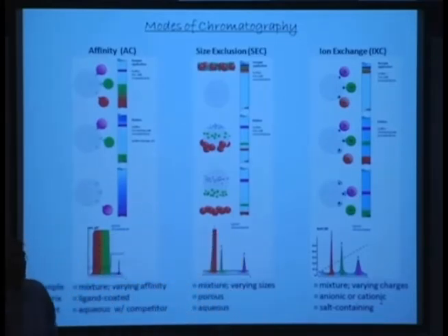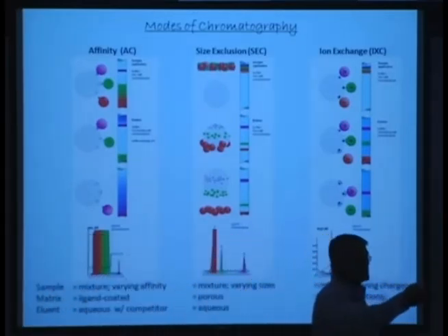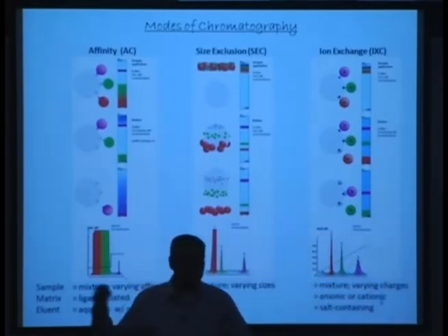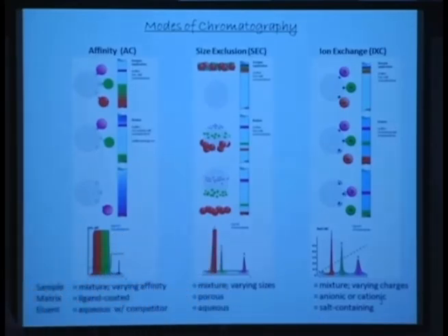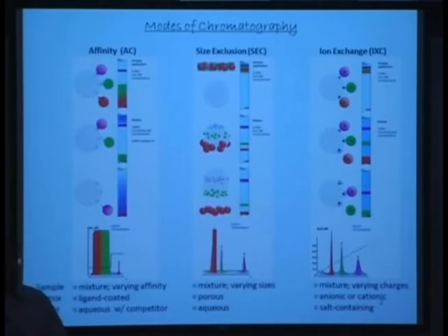So when you start comparing different matrices, and assume that a certain person has done this analysis with this particular matrix and I'm going to do it with this matrix and extrapolate the results, that might not happen. Every matrix has to be calibrated with an appropriate standard. And you have to be careful. There are some matrices, polyacrylamide-based sieving matrix. Polyacrylamide typically interacts, with good hydrogen bonding capability and good hydrophobic interaction. So you have to be careful.